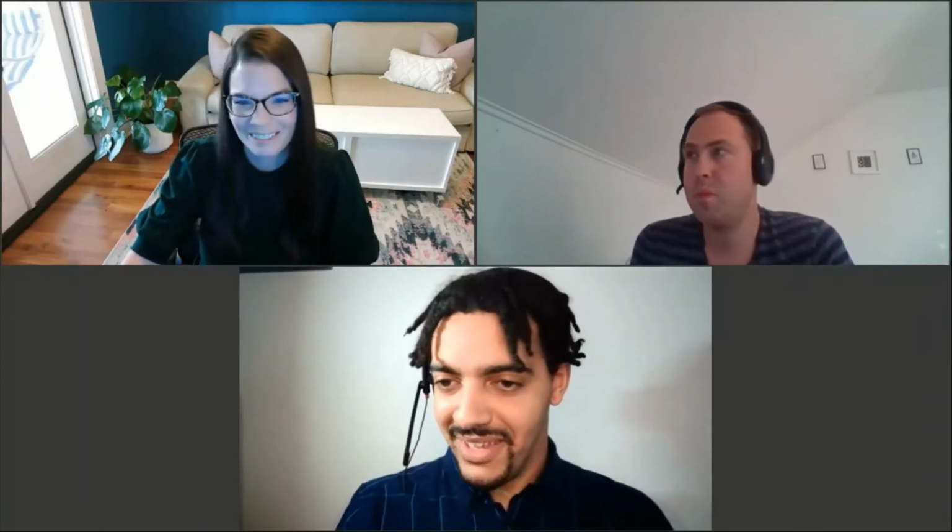Thanks a lot for that. Any additional comments from Marianne before we move on? No. Okay. Next question goes to Dehan once again. What CQAs could be effectively monitored by inline Raman spectroscopy?